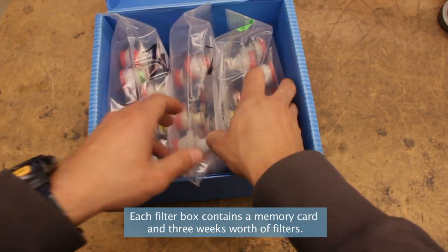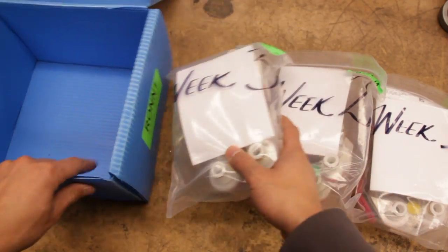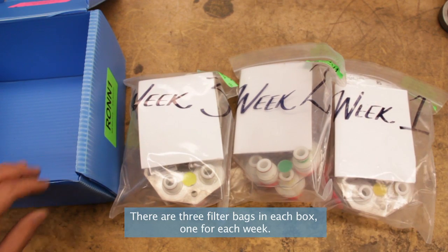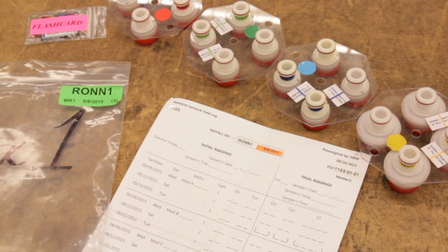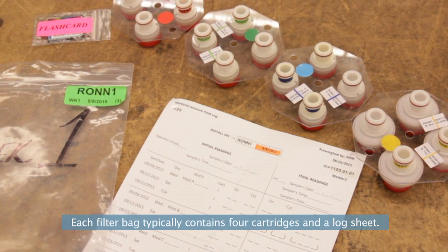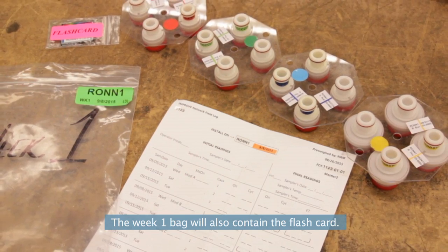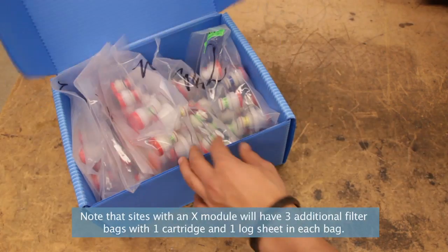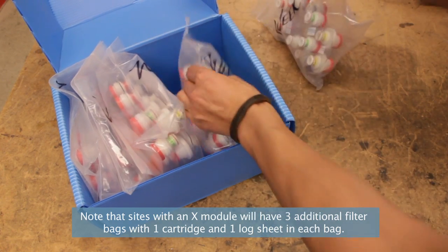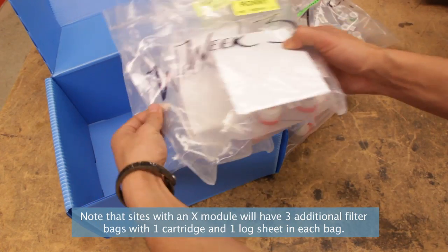Each filter box contains a memory card and 3 weeks worth of filters. There are 3 filter bags in each box, 1 for each week. Each filter bag typically contains 4 cartridges and a log sheet. The week 1 bag will also contain the flash card. Note that sites with an X module will have 3 additional filter bags, with 1 cartridge and 1 log sheet in each bag.